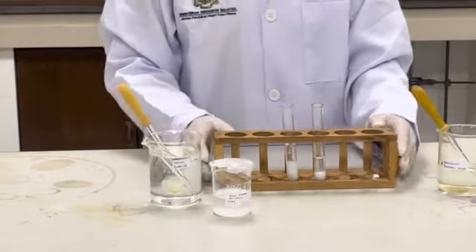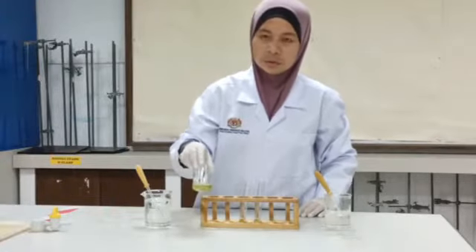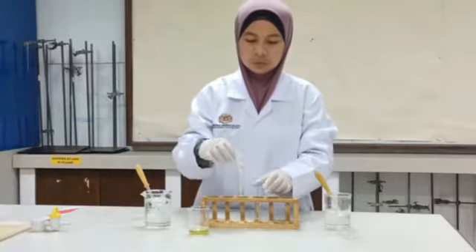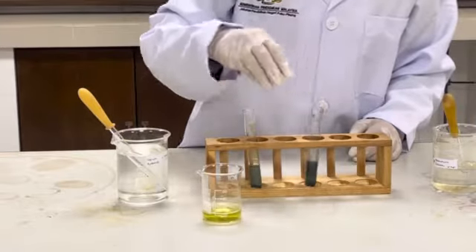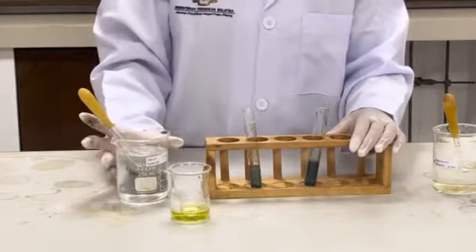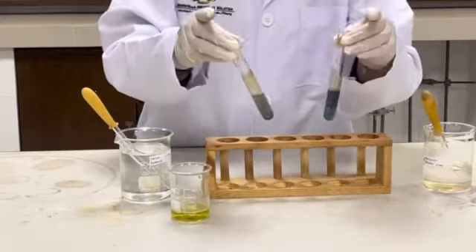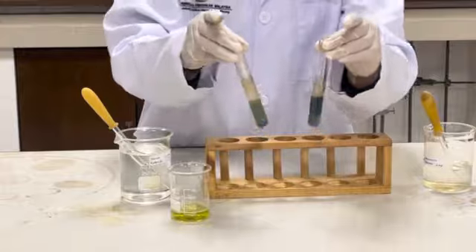Now we have iron(II) sulfate solution and we want to test the ion, which is Fe²⁺. Now we have 2 cm³ of iron(II) ion. For both of these experiments for the iron(II) cation, when you add excess sodium hydroxide and excess ammonia solution, you still get a green insoluble precipitate formed for both.